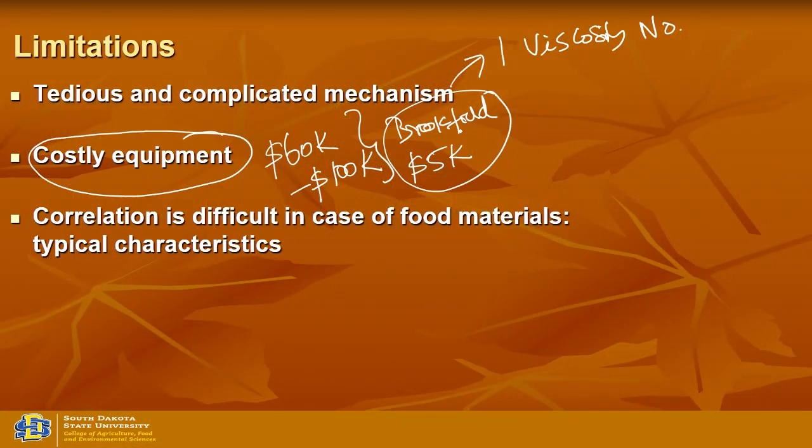But I don't know how long that instrument will work, but that's what it is. Because the instrument that we have in our lab, when I joined the lab 25 years ago, I got this instrument, rheometer, viscoanalyzer. Still it's working. But I don't know, that could be the case when you get the instrument from China.